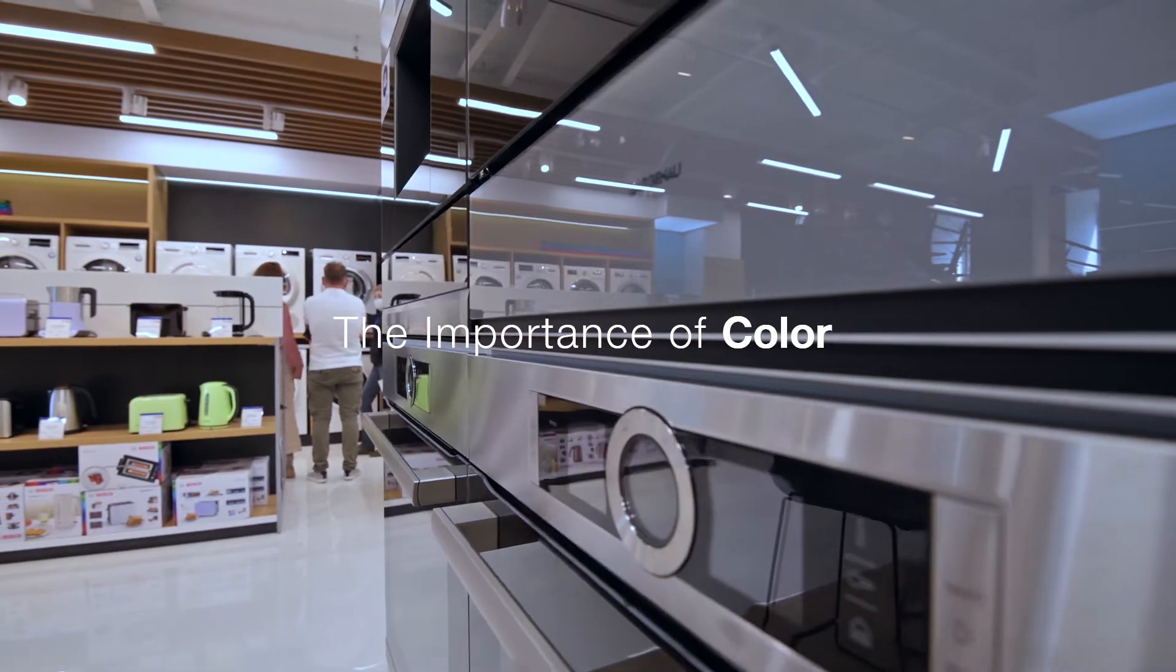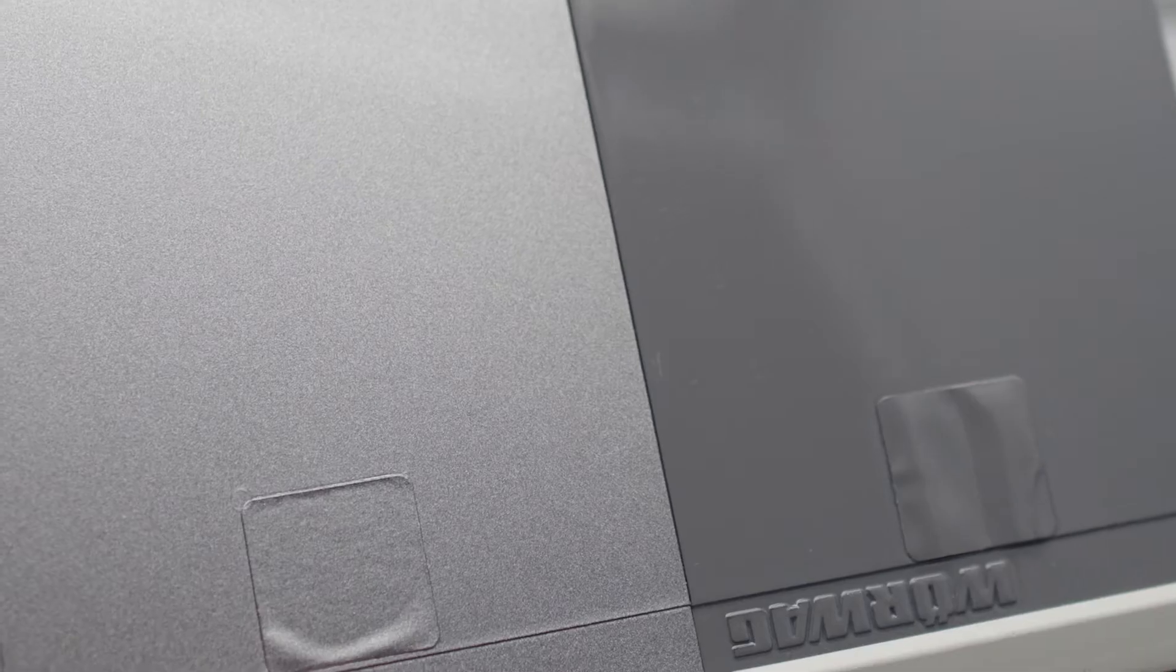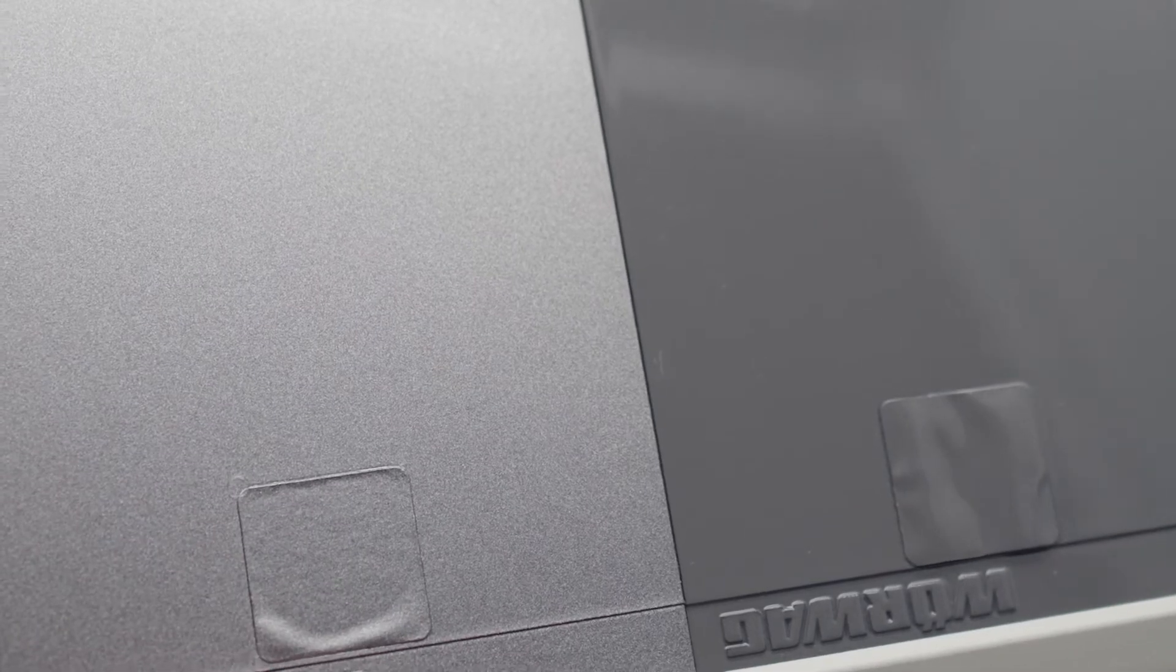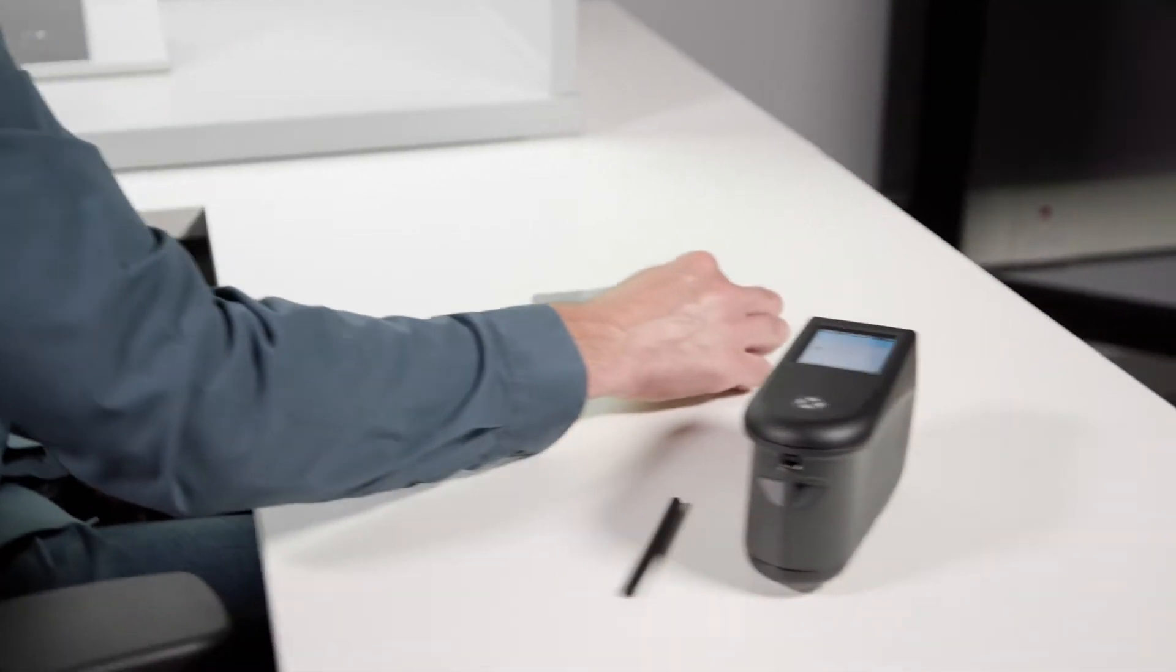Effect colors are not one-dimensional. They act as chameleons, changing with the scenery. So how do you measure something as fluid as effect color? You use multi-angle color measurement.